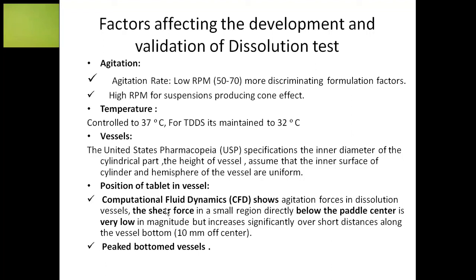Next, for light or floating drug delivery systems, it is very difficult because the formulation floats. A floating formulation does not produce good dissolution. So for these cases, sinkers are used. These are coiled metal wires inside which your formulation is placed, and they enable sinking of those formulations which are floating in nature.